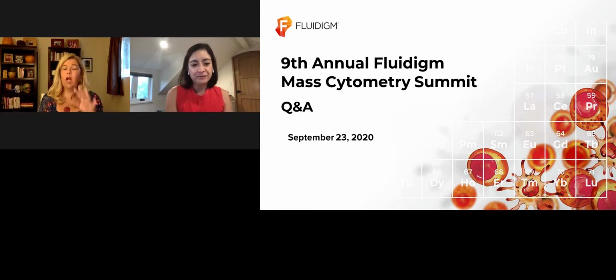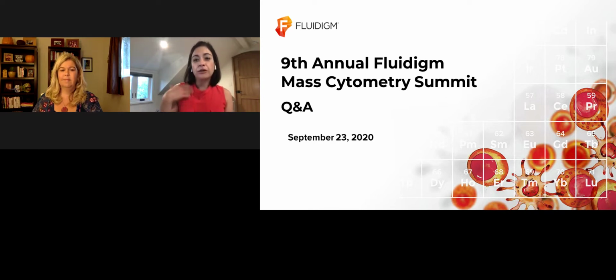Now, one of our audience members wants to know, can you speak to the advantages of using mass cytometry and AbSeq in your research? That is something I'm pretty excited about, in the sense that we often have identified these cell populations of interest using mass cytometry, and then have the opportunity to use that to inform what cell populations we want to go after and get more information on. I think we're all hungry for parameters. And of course, with the CyTOF, we can do amazing things. But then doing unsupervised transcriptomic analysis, we get even more parameters.